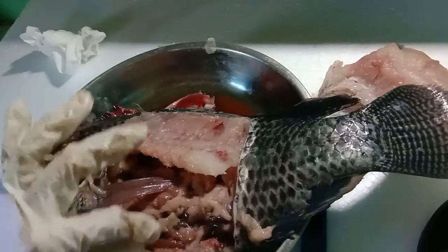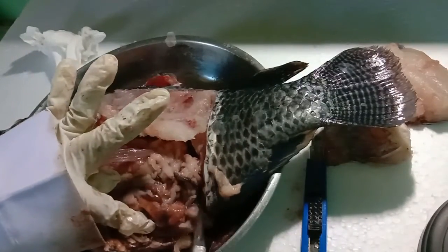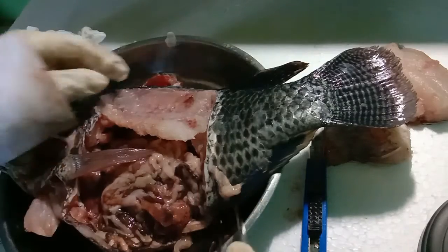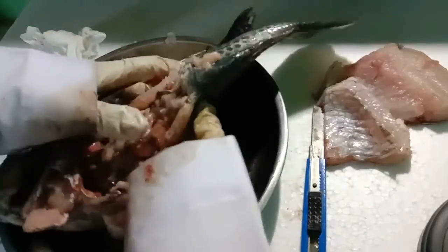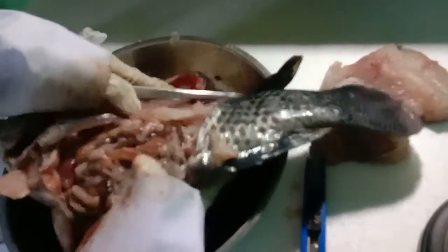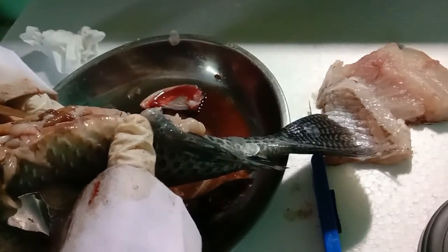The rectum must be at the end of this intestine, maybe here, and then it will be excreted through the cloaca or hole. I think it's cut here. Here's the anus or cloaca. It's not quite clear. You can see here, this is the cloaca.